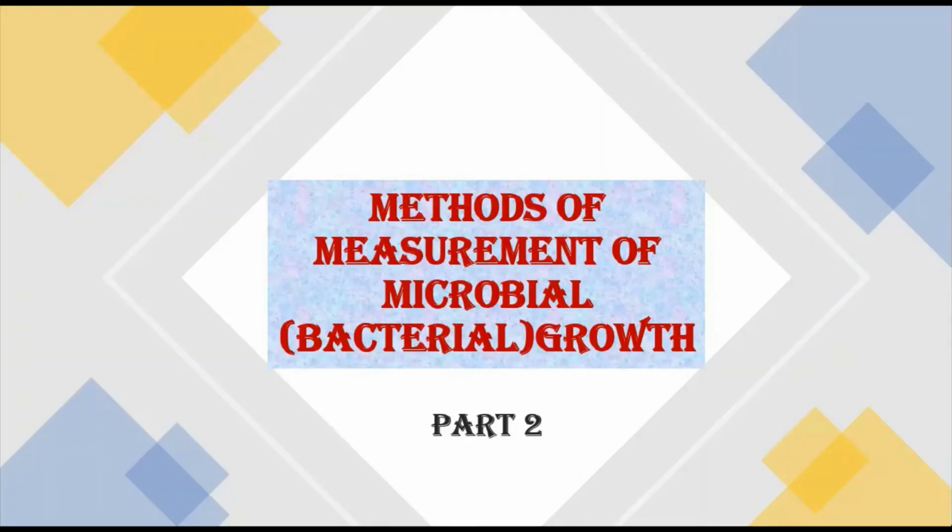Hi everyone. In the previous part, that is part 1, we have learned about direct microscopic methods to measure cell numbers. Now, in this part, we are going to discuss indirect methods of measurement of cell numbers.